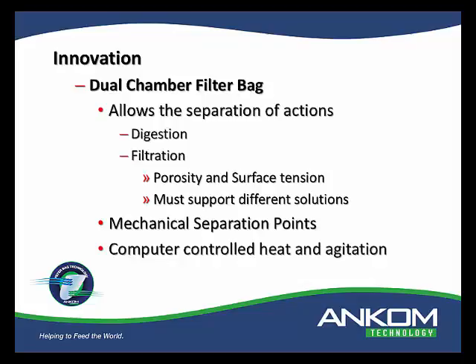In our case, we've been able to develop a filtration matrix that has a porosity of 8 microns or lower, and then we use diatomaceous earth, at least in one of our phases, just to aid in the filtration, but the porosity itself is already set by the filter bag itself.